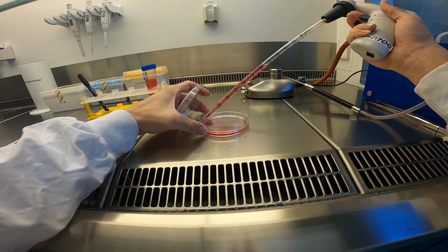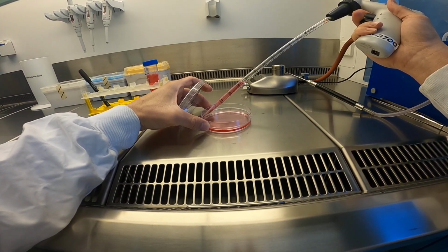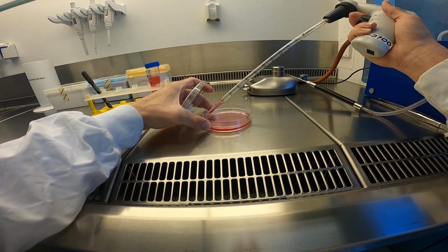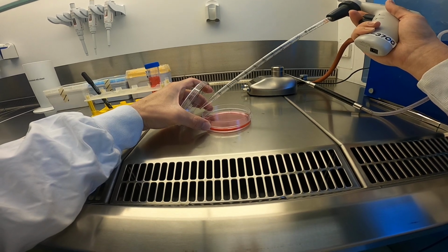The reason not to do it in the center of the plate with full force is because that way you will be making cells loose from the bottom of the plate, and you might actually be damaging them, but also you might be activating some cells because of the mechanical stress.